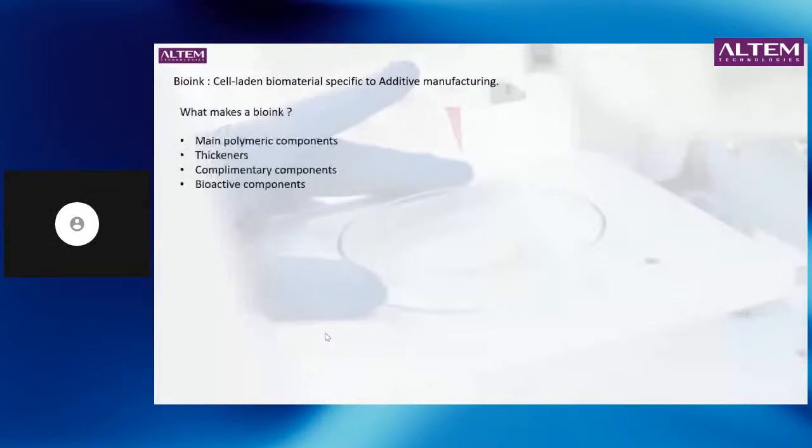So what makes a bioink is the first question. Bioink is basically a constituent of the main polymeric component, say the hydrogel material or any synthetic or artificial biomaterial or a polymer. Then you have thickeners, you have complementary components and bioactive components. Going down one by one. Main polymeric component, let's assume gelatin, or alginate or chitosan or collagen. These are general polymers which are in the processed form, in the hydrogel form.